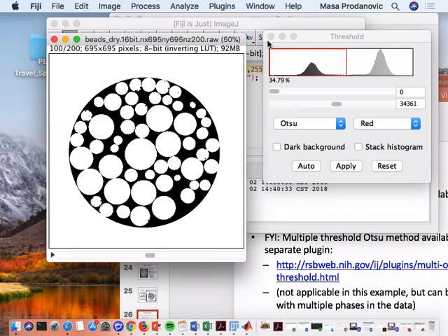But the one basic problem is that you have a whole lot of other stuff around this image that you have to figure out how to discount if it's not already removed. Now, if you did some opposite thing and your background is still black, then possibly, if you did clear outside, counted with the pore space, and that's dangerous too.